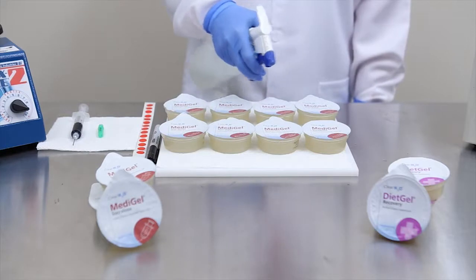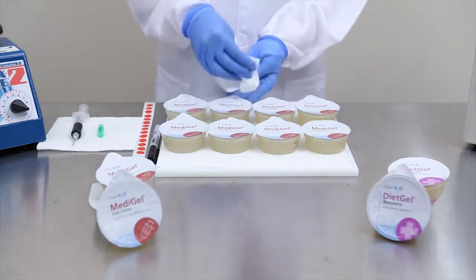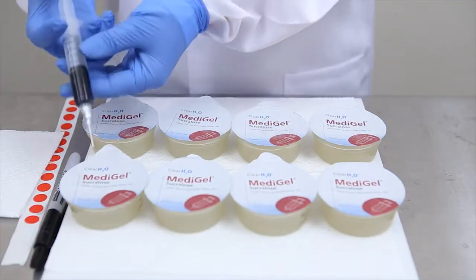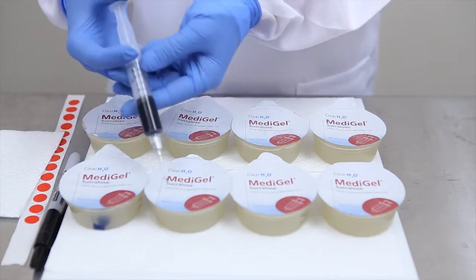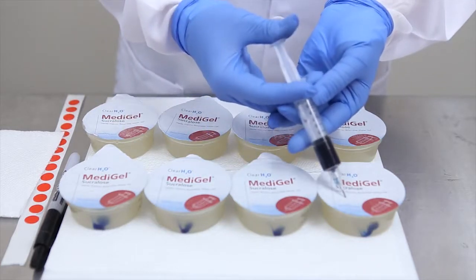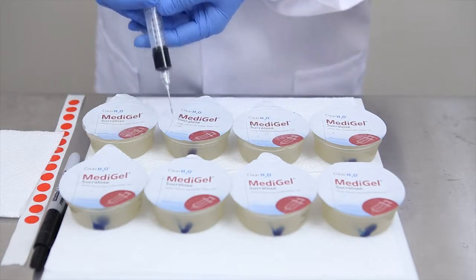After drying the cups from the water bath, follow aseptic technique to prepare the cup lid surfaces for injection of your pre-measured medication. After previously determining the medication dosage concentration required for the Metagel 2-ounce cups, using a syringe, carefully insert the needle through the cup foil lid and inject the required volume of medication, repeating this procedure for all cups.